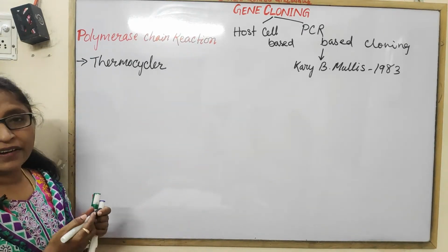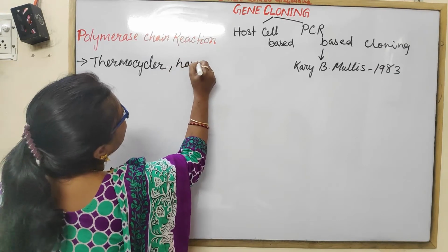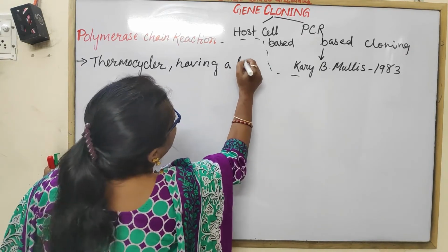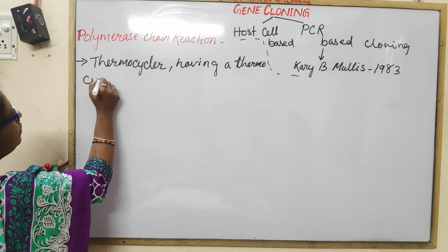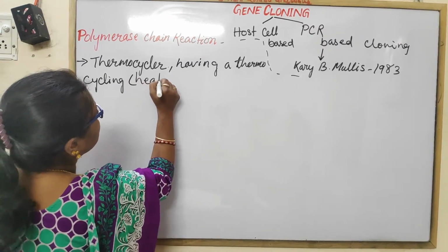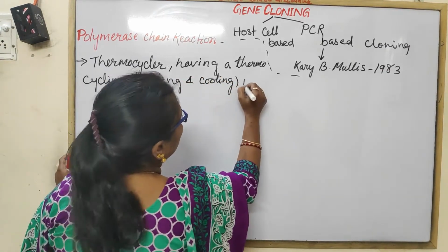It has a thermocycling program, that is, a heating and cooling program.